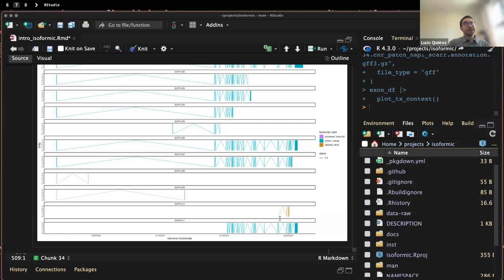So like I said, here we are using just common knowledge, or what is already known in the literature, what's already in some database. But you could even go deeper and generate your own annotation, really use a data-driven methodology to find which transcripts are really detected in your data set, doing a de novo annotation or reference-based de novo annotation that actually uses known transcripts to expand that. There are several methodologies that can enhance that, but usually they are steps previous to that analysis. Which group of transcripts we are using to go downstream in the analysis is not in the scope of that workflow.